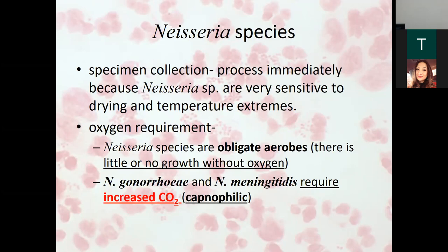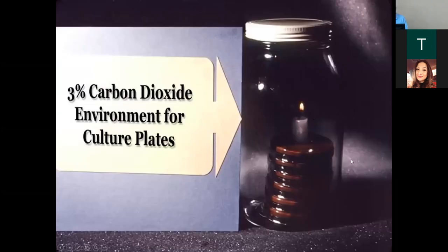We're going to see our little candle jar that we're using today, even for our strep cultures downstairs. We're going to do this again next week when we do our Neisseria. There's our candle jar. It makes a 3% carbon dioxide environment when I burn my little candle in there. I've got my plates down here and my top on. That's my pickle jar. Like I said last week, remember the dill pickle jars that sit on the counter at the convenience store? That's what we use, cleaned out. They work great for that.